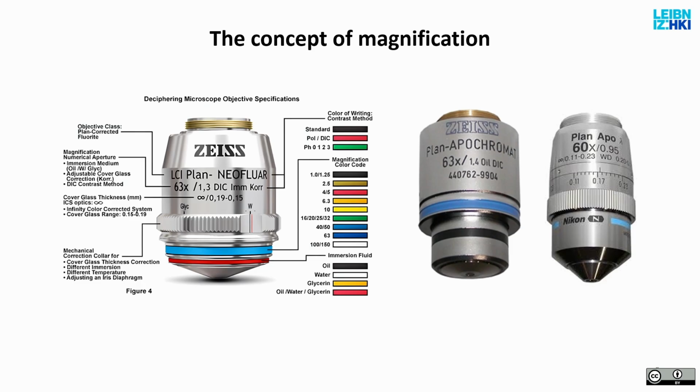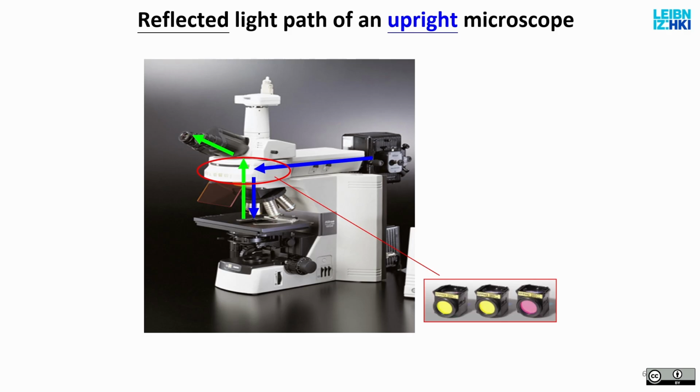And finally, if you use a sample where you need very high resolution, but the sample itself is not in water or Vectashield, but rather very, very close to the coverslip, so the light does not travel through the mounting medium of the sample, then you would use oil, and in this case you would turn this one to oil. If you don't set this up properly, you have the same effect as here, namely ruining the quality of the image. These were the answers for this one, and you got this one right.